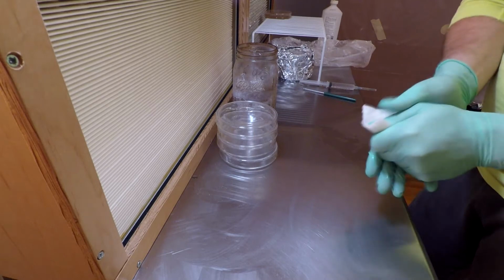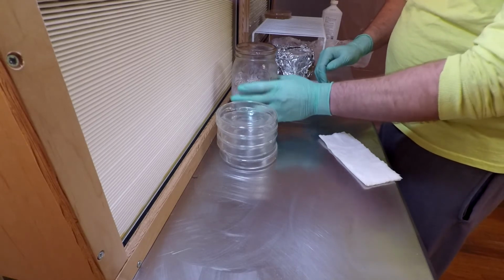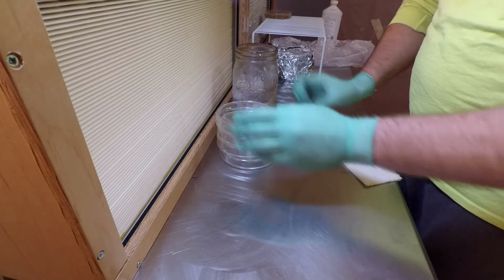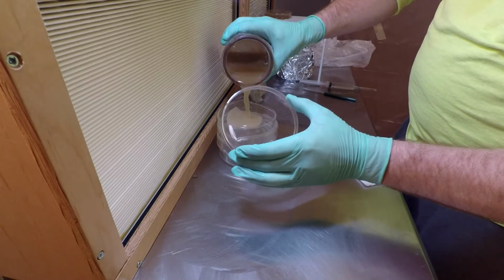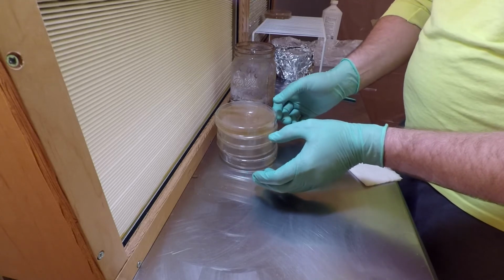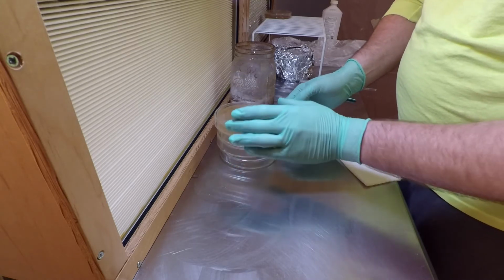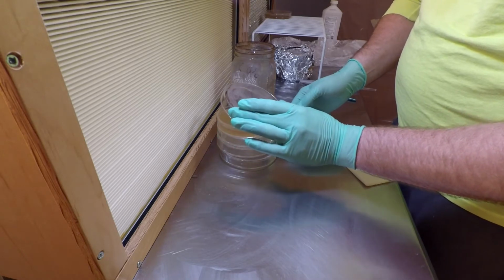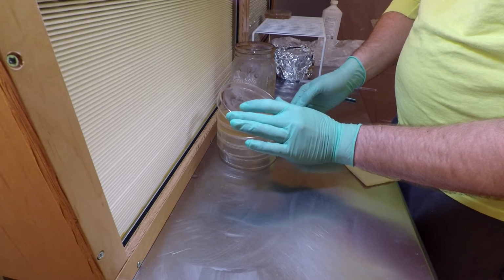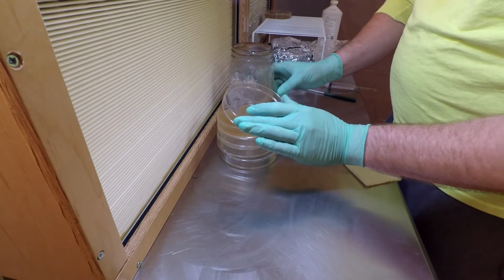All right, 5 minutes later, and with gloves on, when I put my hand on the jar, it just feels barely warm now. And I can see inside it that it's coating the inside of the jar pretty well. So let's try another dish. That's a little too full now. And still some light condensation. Might need to cool it off just a tiny bit more.